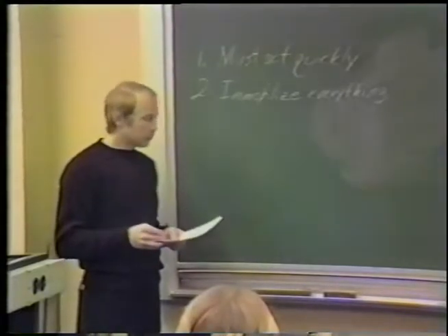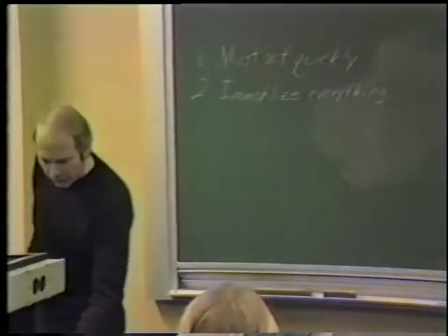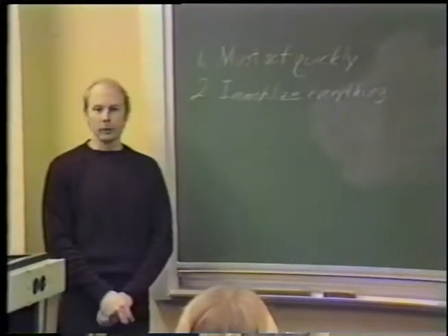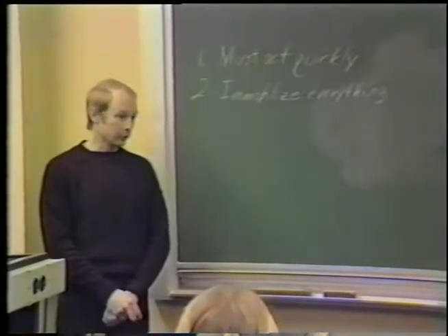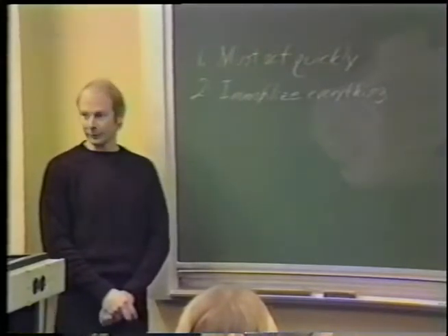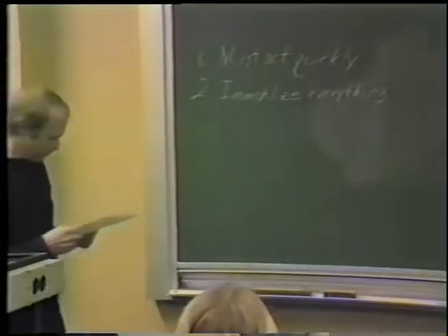Okay? And glutaraldehyde and osmium, in fact all known chemical fixatives, alter the permeability of biological membranes in such a way that ions and small molecules can escape from any compartments in which they're sequestered and redistribute within the cell or be lost from the cell altogether. It makes localization of these species virtually impossible. Okay.